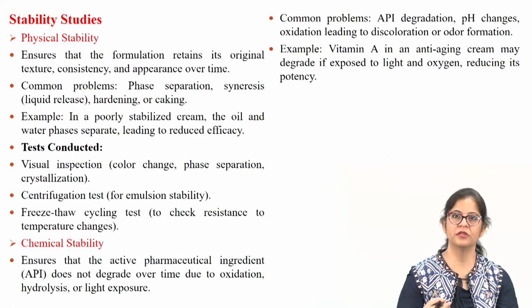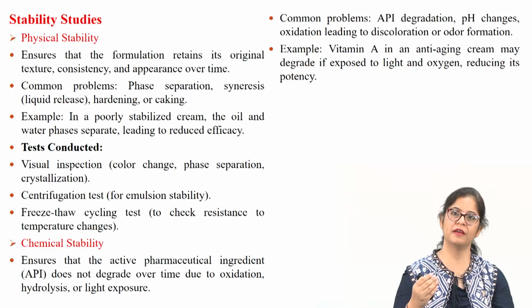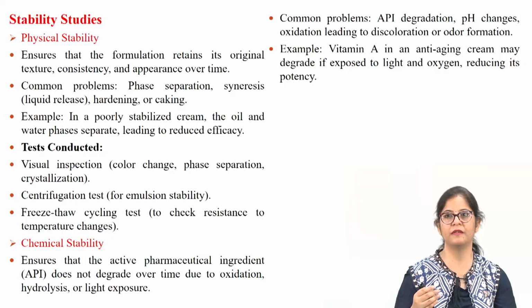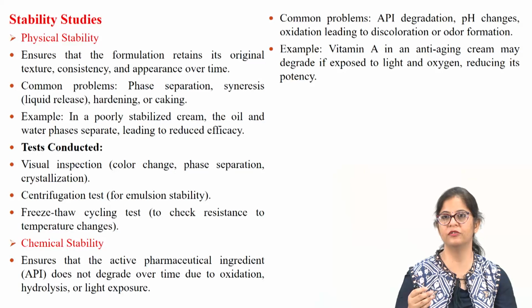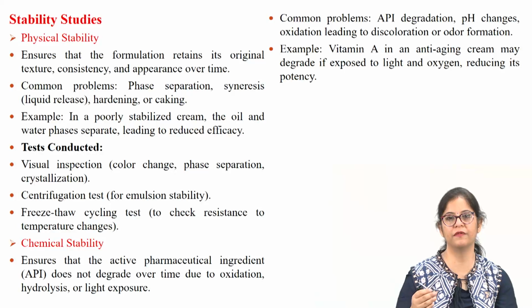Stability is important. Physical stability ensures that the formulation retains its original texture, consistency and appearance over time. Problems include phase separation, syneresis, liquid release, and hardening or caking. In a poorly stabilized cream, the oil and water phases separate, leading to reduced efficacy. Visual inspection for color change, phase separation and crystallization, centrifugation for emulsion stability, and freeze-thaw cycling can be done to test the physical stability of the product.